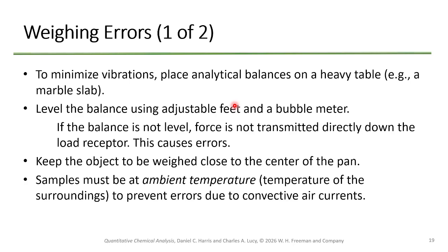Typically, to minimize vibrations, you're going to place analytical balances on a heavy table. Usually, a marble slab is actually the best way to do this. This is actually a major problem that's developed from having new labs. Back in the day, they used stone for everything. That was like the top tier deals. Sometimes it was asbestos, which worked really good until somebody fractured it. Then you breathed it in. Not so great. Though I guess if you're wearing masks, not such a big deal.